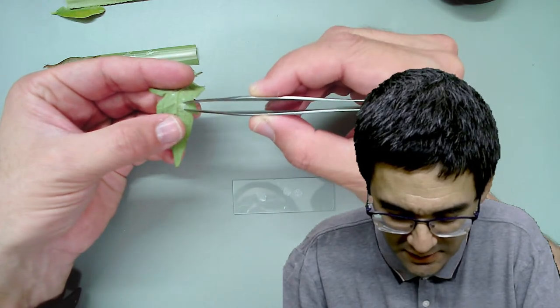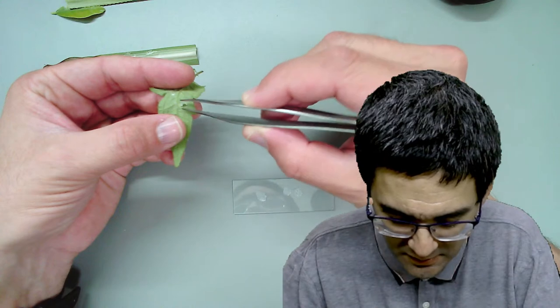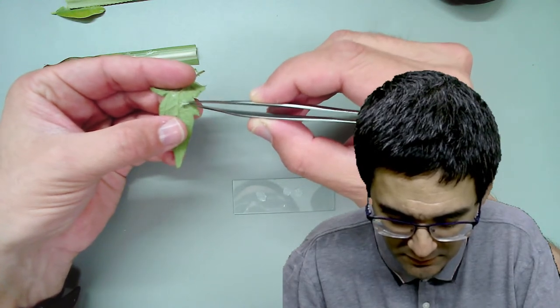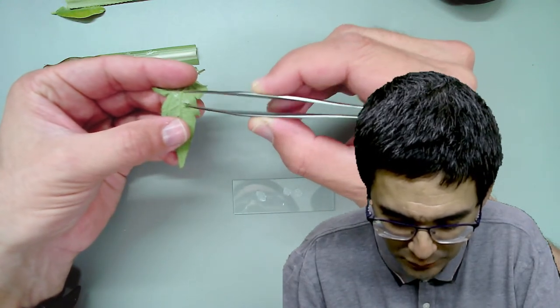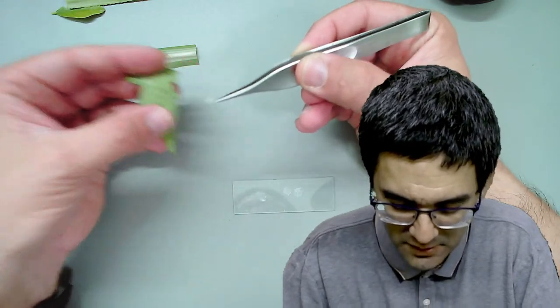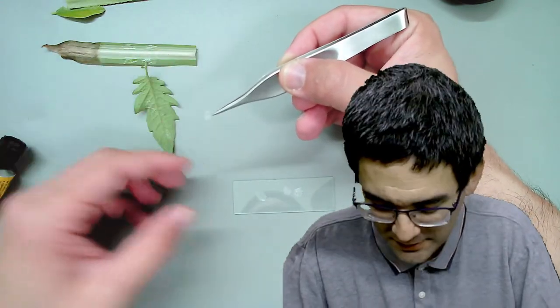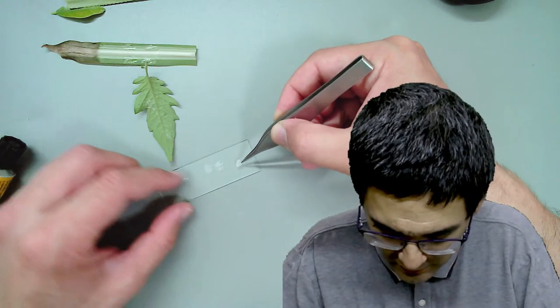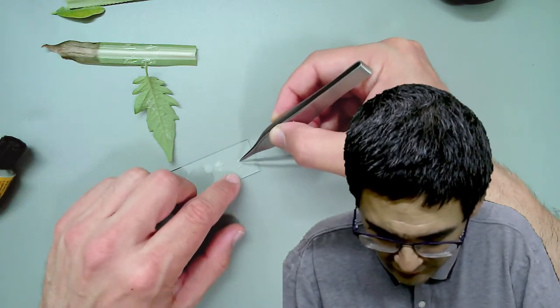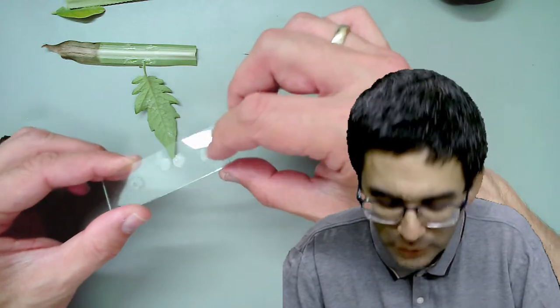This is going to be really difficult to remove because first the leaf is quite thin, and second it's not quite smooth, so the glue and the leaf will probably stick together quite well. I might actually end up destroying the leaf a little bit in the process. Yeah, it's difficult to separate. This is now the tomato, the bottom side of the leaf.